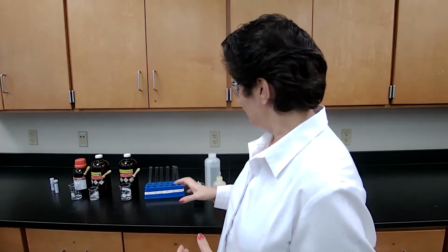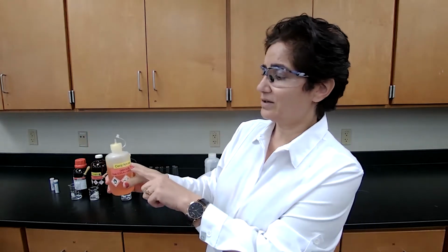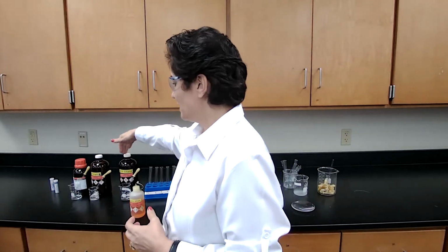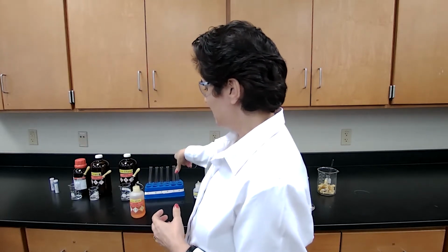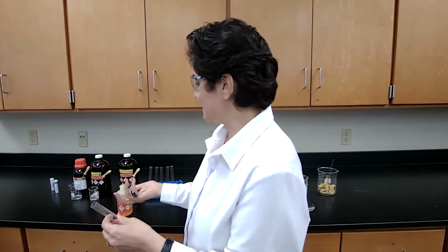The next functional group test that we are doing, or the first one in the procedure, is the ceric nitrate test. Ceric nitrate would give a dark color if the functional group is alcohol. If the compound has an alcohol functional group, we get a dark color. So I have 3 compounds here: ethanol, hexane, and pentene. I'm going to test these 3 compounds with the ceric nitrate. So you could see, if it's positive, how would it look? If it's a negative test, how would it look?